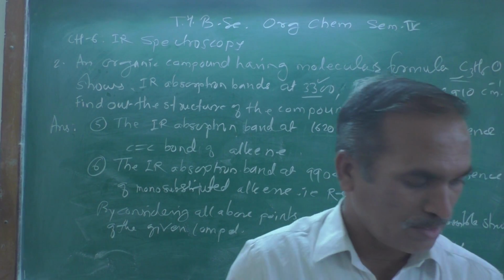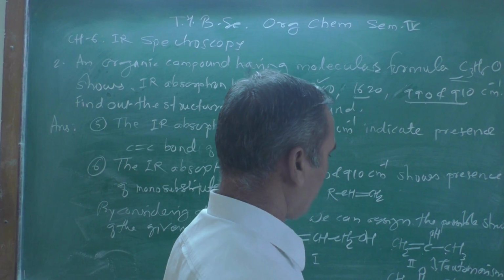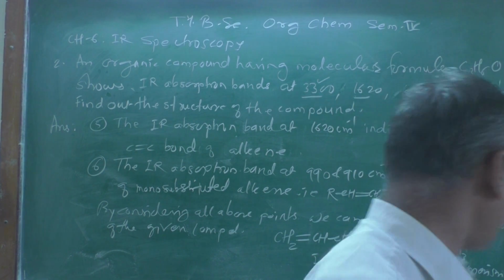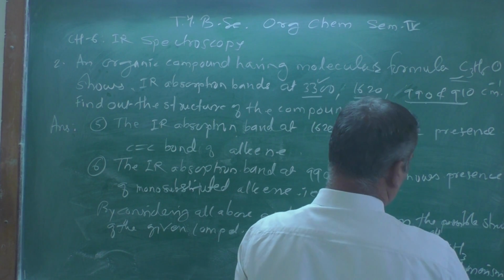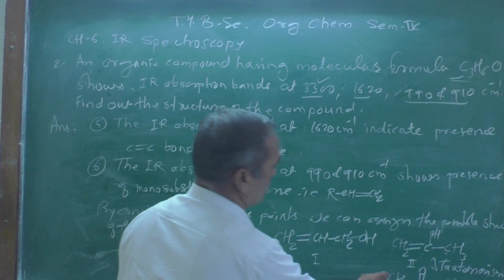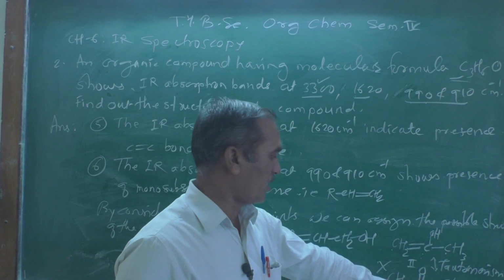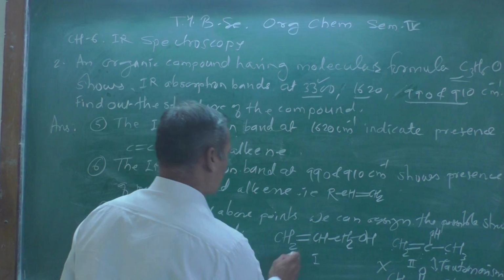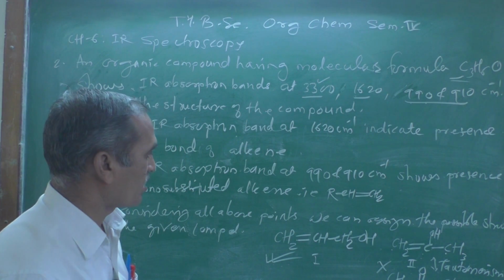That's the compound we are going to get over here. So structure number second is converted into a ketone. The possibility of the second structure is ruled out because that enol form gets converted into the keto form, and therefore structure number first is the correct structure.